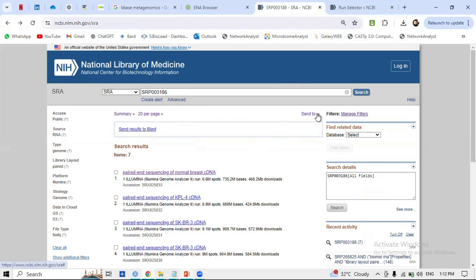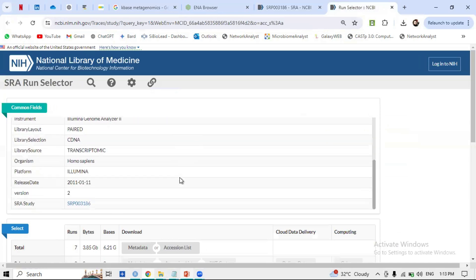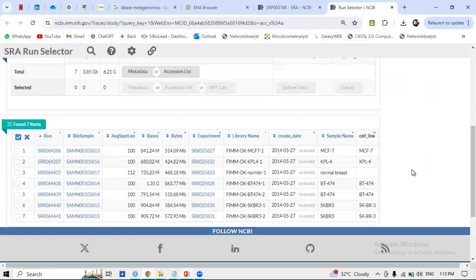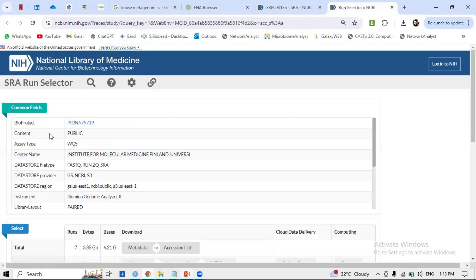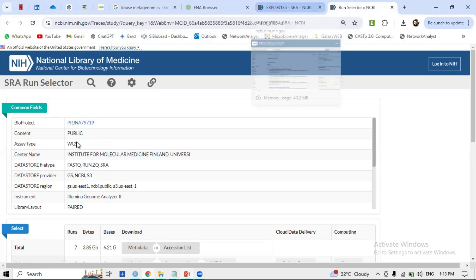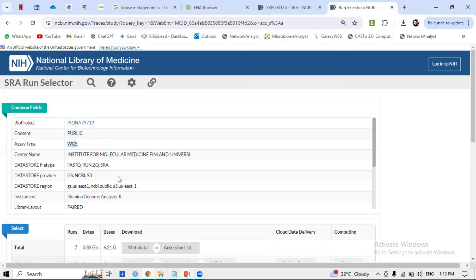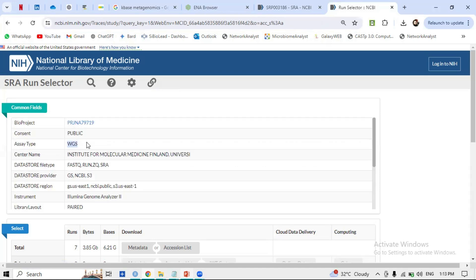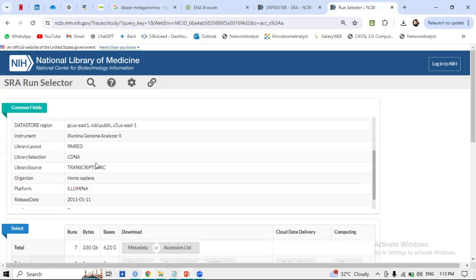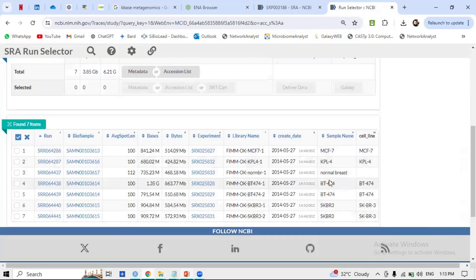After sending to the SRA Run Selector, a platform appears that can easily provide the metadata. We can see the BioProject accession ID matches between ENA and NCBI — confirming they are integrated. The assay type is WGS, it is paired-end, complementary, transcriptomic, Homo sapiens, and generated by Illumina — fulfilling all our requirements.